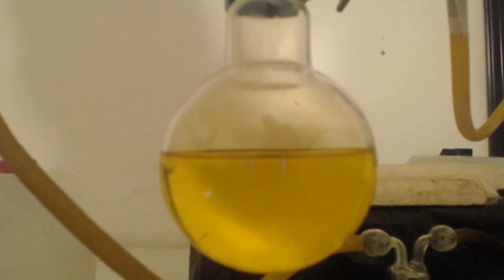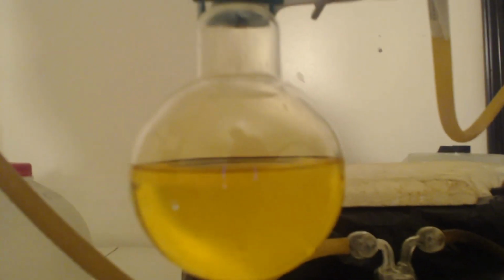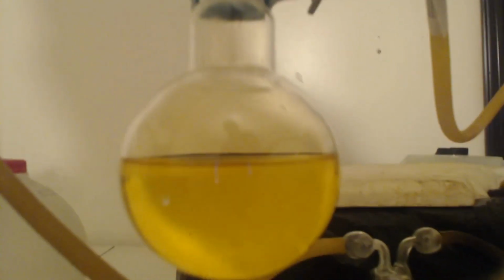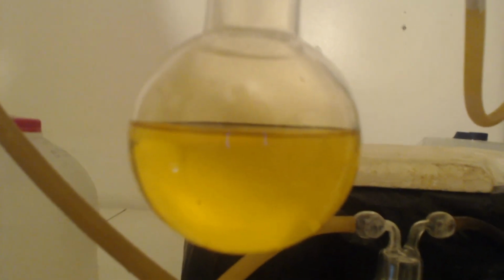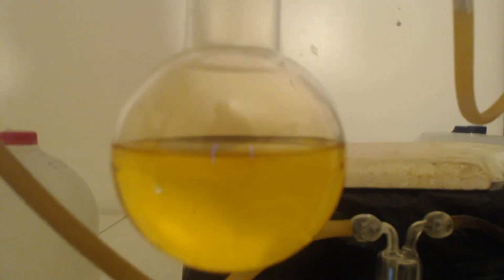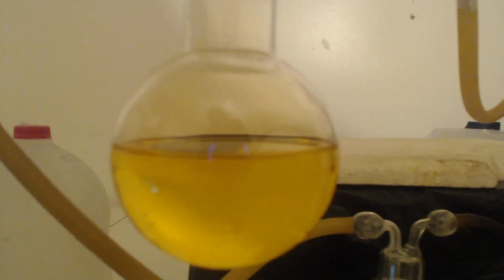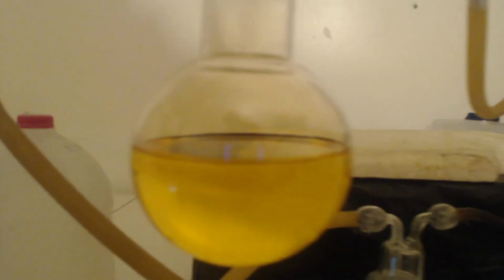I did add in an extra 30 milliliters of sulfuric acid. That's another half a mole. I just wanted to see, because I already know the percentages. The way I'm getting a better yield, like from my other videos, my last one, I only got 50%. Now I'm getting like 95, 96 or whatever, 94. I don't know, I've got to look. But anyways, it's by adding more sulfuric acid. So I figured, well, maybe if I add a little bit more, let's see what happens. Do I still just get the 95%, or does it go up to 100%? Well, we'll see in a second here.